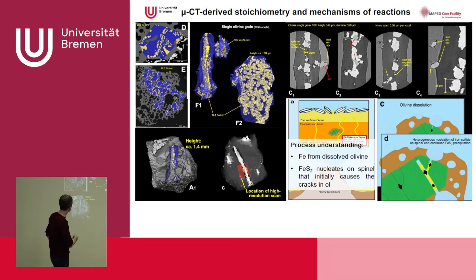And I see if I take all the iron in the olivine, precipitated as iron sulfide, it is about 20%. And then I compare this with what I measure, and we see it matches very well. I have a grip on the reaction that's happening. So all the iron was immobile in the rock, even due to the hydrothermal action, and it stayed there and precipitated with the sulfide. So I did it by measuring the volume of 3D models.